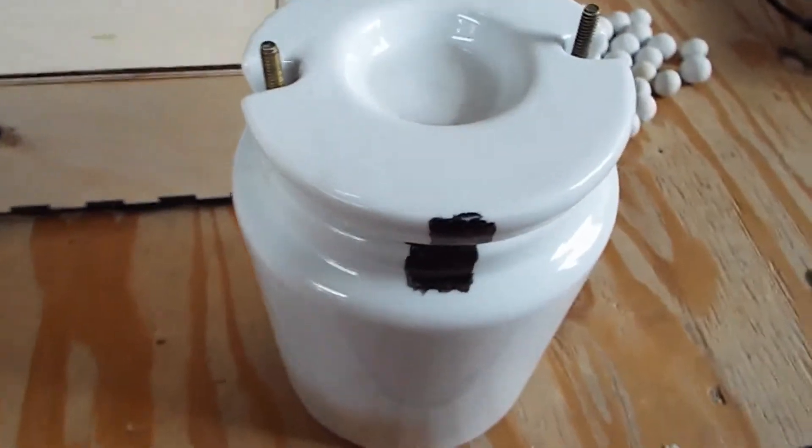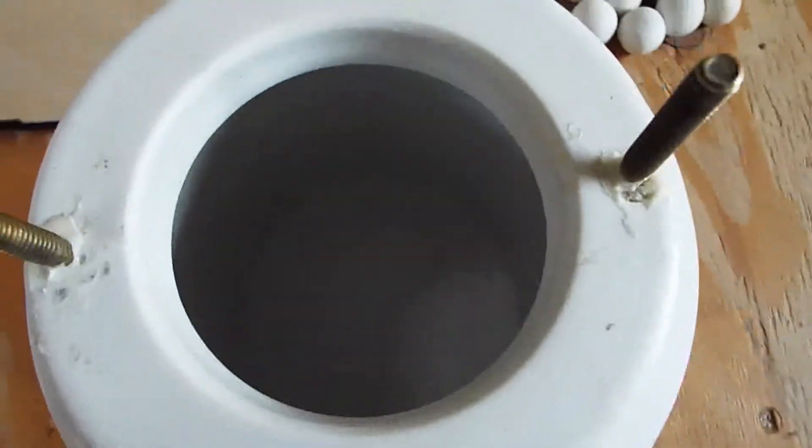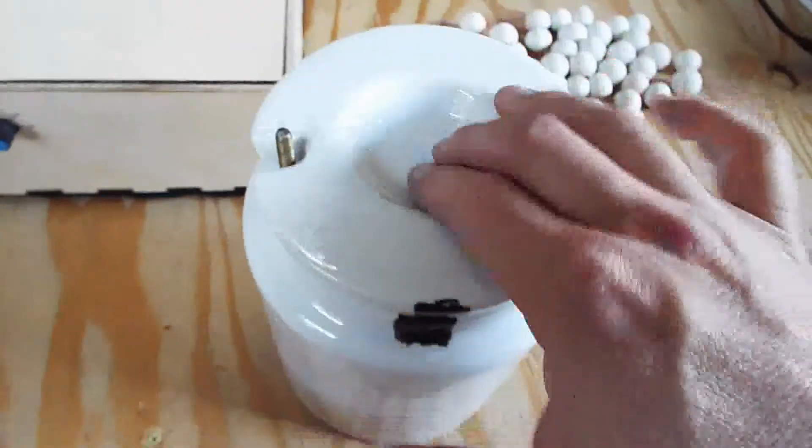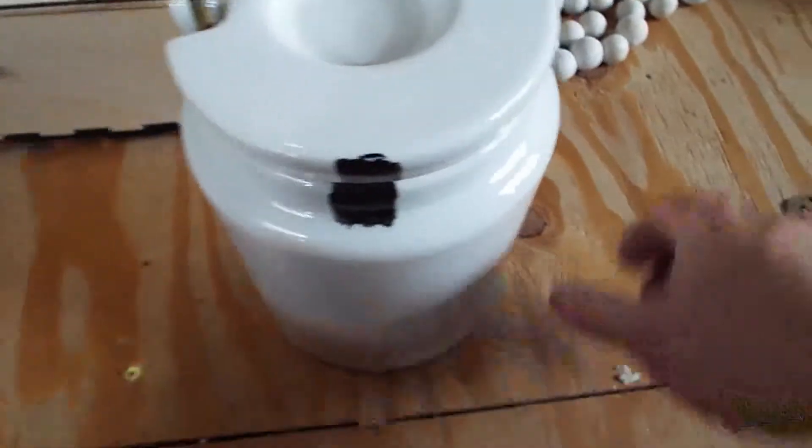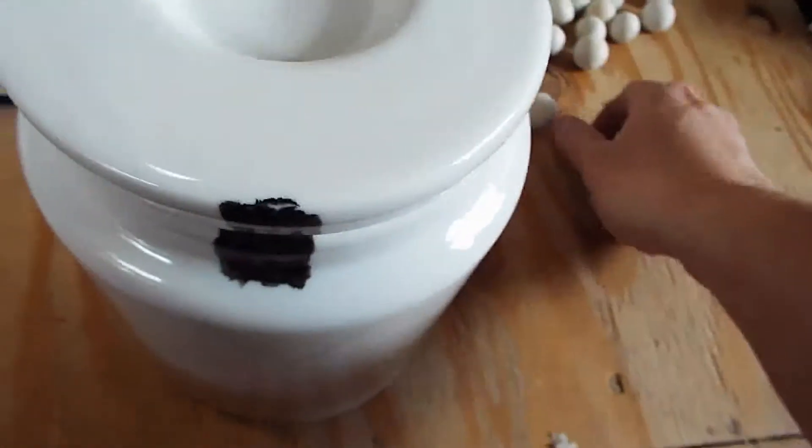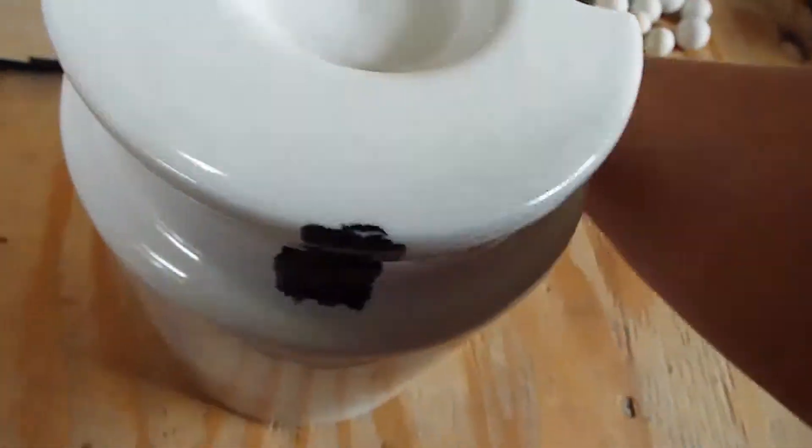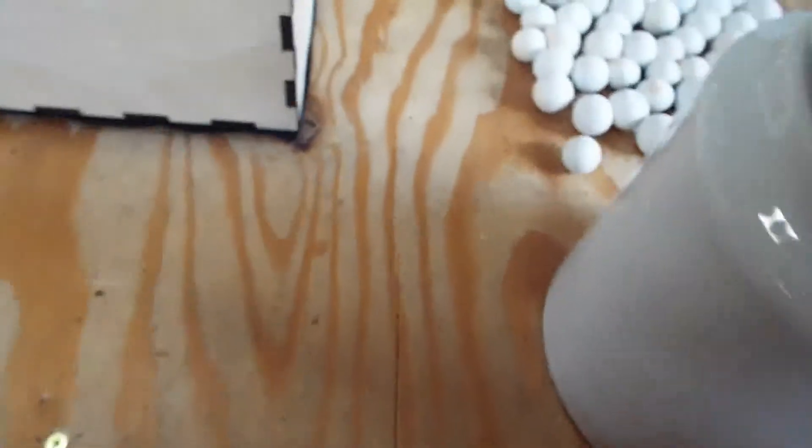So the first major thing with this ball mill is I'm using a ceramic jar here. The ceramic jar can be used with glass marbles or with porcelain or ceramic ball media. And this allows you to grind material without contaminating it with metal. If you're using steel balls, it would contaminate the grinded material with the steel particles.